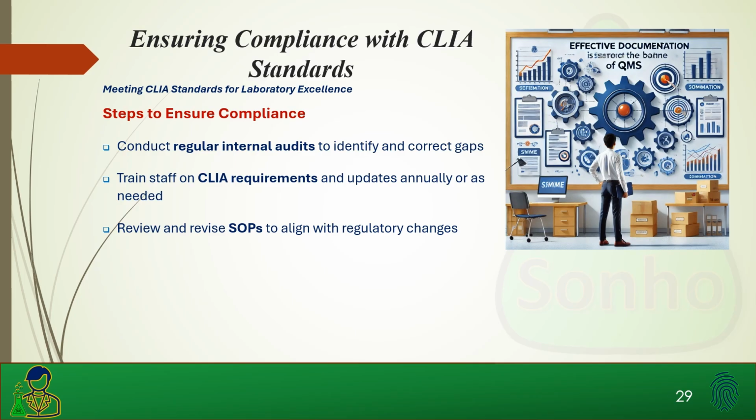The QA monitor helps. If you have some kind of quality assurance monitor in place, that helps improve your QMS system. Because if you have a QA monitor, especially if you have a monthly QA, and I like to do a monthly QA, it helps keep track. You can look at it quickly over a year and get a snapshot. If you have a month by month snapshot, it can give you an idea of what's going on in your laboratory and what could be improved.